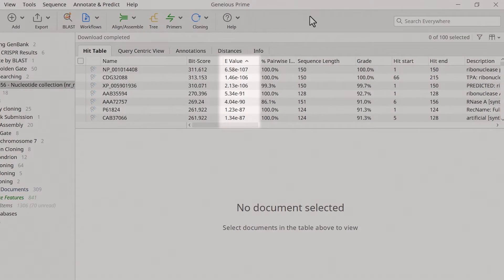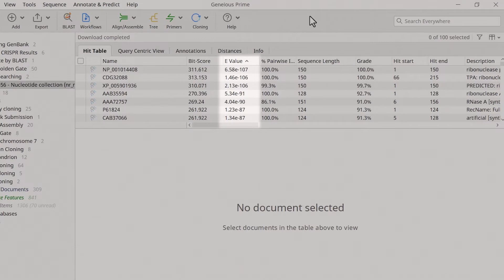The e-value indicates the expected frequency of occurrence of each alignment by chance. So, very small e-values suggest it's highly unlikely that the alignment would ever occur by chance.